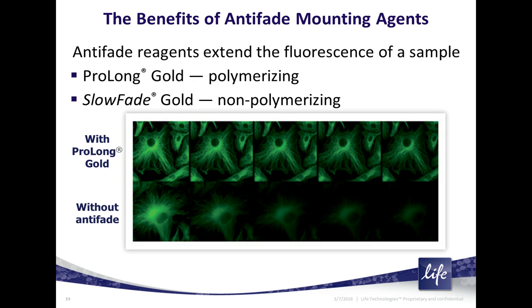One last question here before I go on. What speed do you spin your antibody stocks to bring down the aggregate? Basically, I'm talking about one of those benchtop centrifuges. We call them turtles here. You just put it in and bring it up to the top speed and then let it go back down. That's usually sufficient.